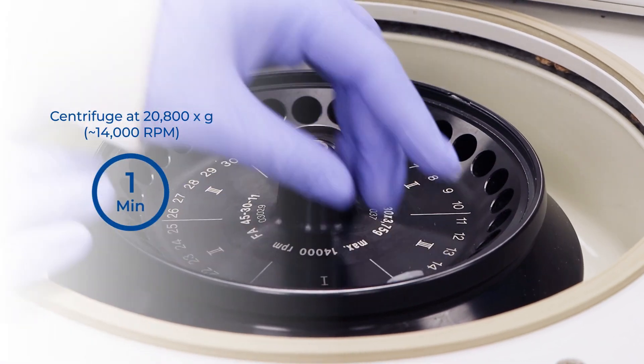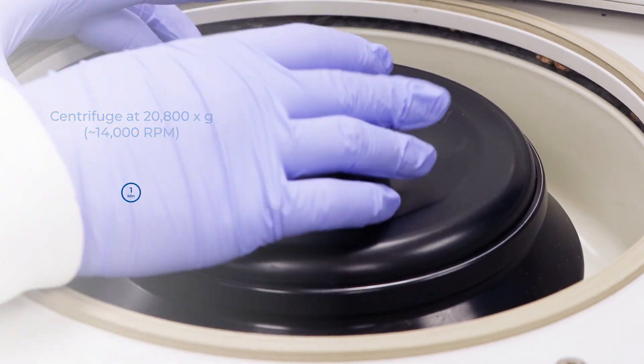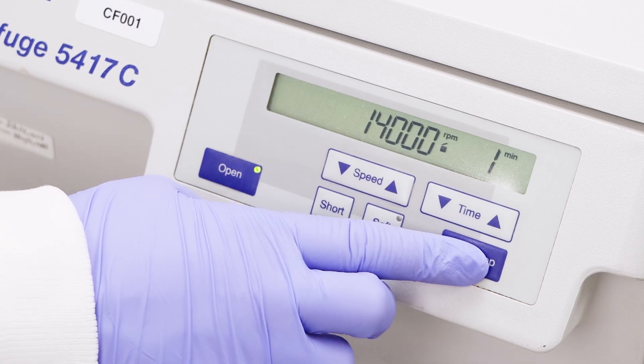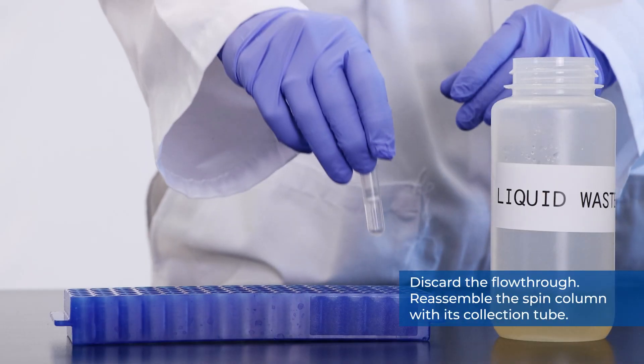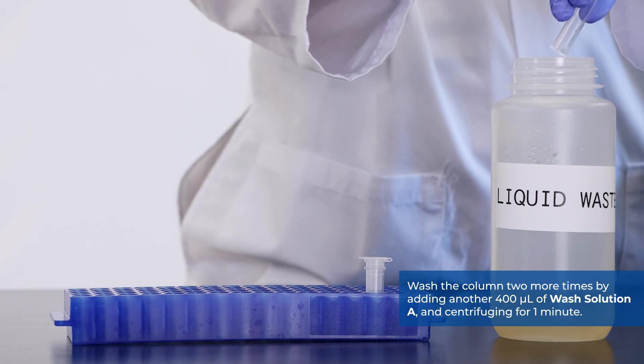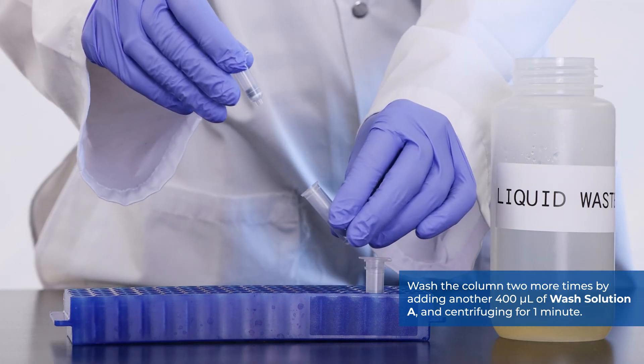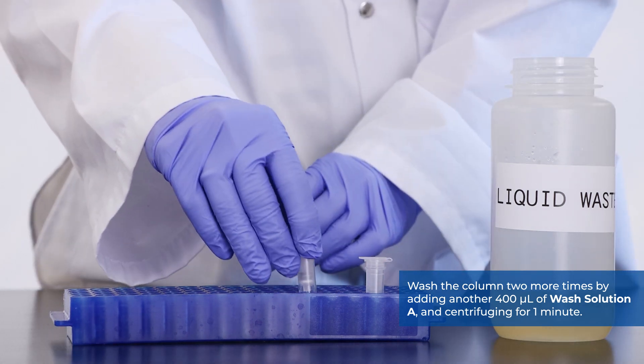And centrifuge for 1 minute. Discard the flow-through and reassemble the spin column with its collection tube. Wash the column 2 more times with 400 microliters of wash solution A and centrifuging for 1 minute.